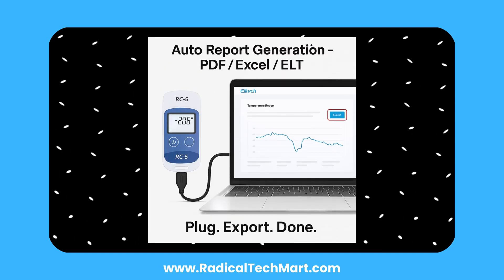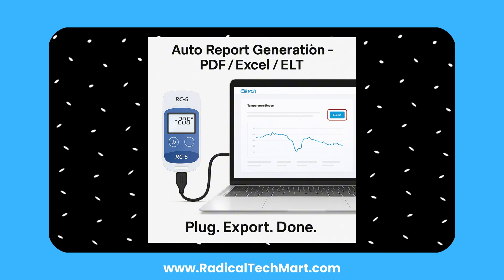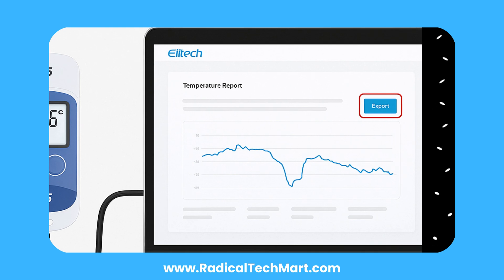When you're done logging, plug the device back into your computer. The Elitec software will display a full summary including max, min, and average temperatures, total readings, and any alarm events. You can view the data as a graph or a list, and export your report in just one click as a PDF, Excel, or ELT file.